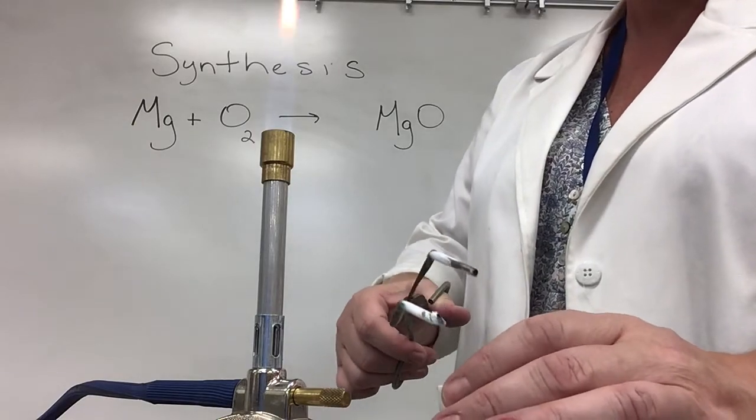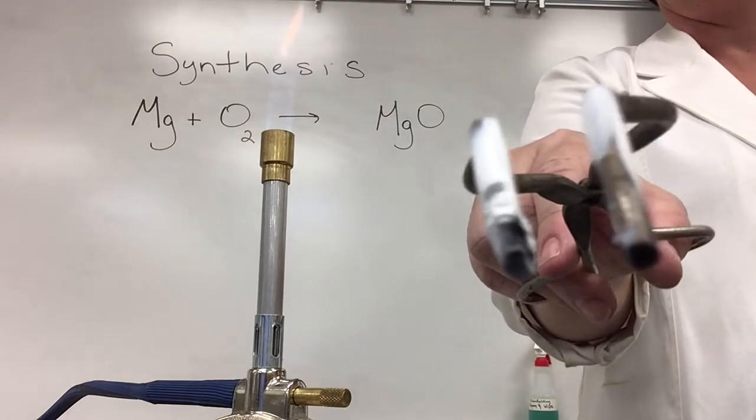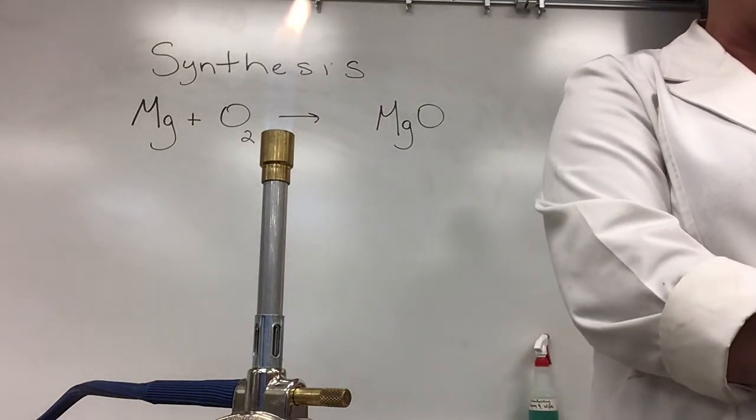Alrighty so what's left is kind of a gray ash and there's a little bit of that gray ash on my tongs as well and I'll show you what this gray ash looks like.